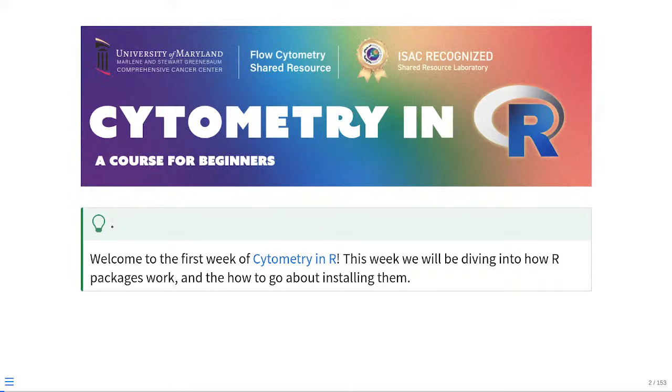So when we're thinking about can we code and can we not code, I don't want us to think of things in such a binary. I want us to think about it as going through cycles of we try something, it doesn't quite work out, we eventually figure out how to get it to work, and then we move on from there. And then slowly but surely we'll be able to do things that we weren't able to do a week, a month, a couple months ago. So that will be the aim of the course.